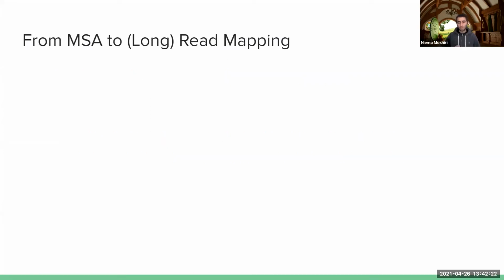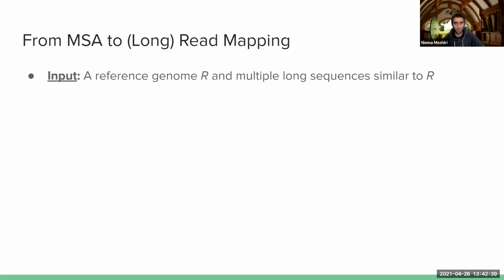Okay, so now this is tying back to something that I worked on last summer, right when the COVID-19 pandemic was first starting. Remember a couple weeks ago, I taught you about this read mapping problem, where I have a bunch of short sequences that I'm mapping to a single reference genome. So my input was a reference genome. And in this case, let's pretend I have what are called long reads. So instead of length 100, let's imagine my reads are pretty long.